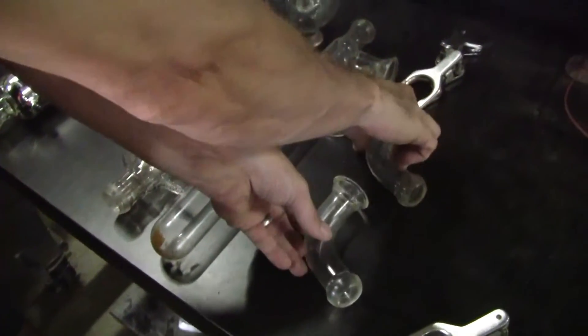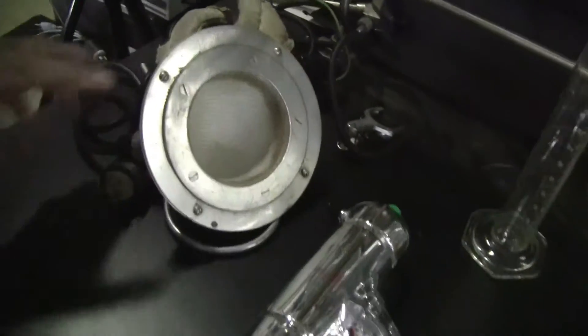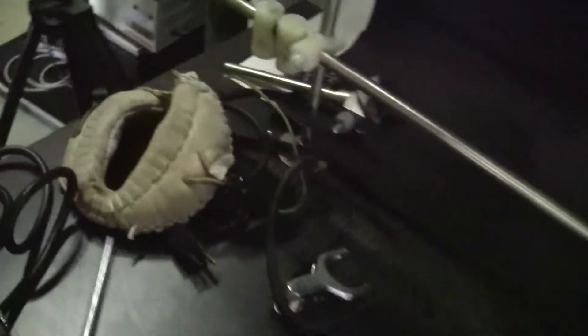And same thing. And is that it? That is it. We have the heating mantle and the top heating mantle. And besides clamps, that's it.